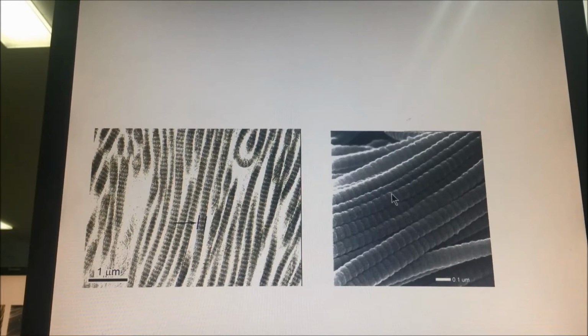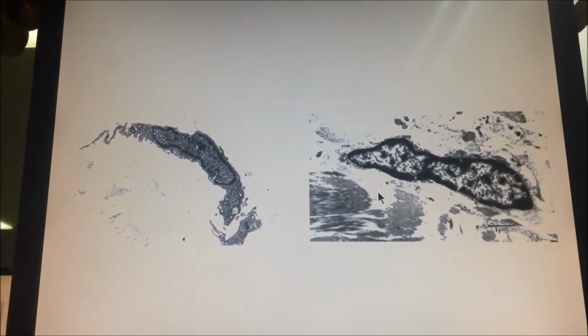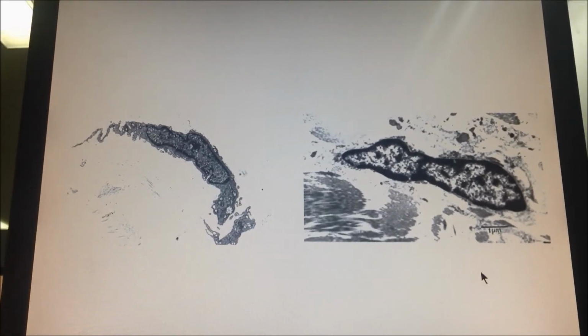الكولاجين هو the most abundant protein in your human body. الكولاجين very strong supportive for you. السيلز عادة اللي بتصنع الماتريكس أهمها هي الفايبروبلاست. Over here you see two electron microscope sections for a fibroblast.